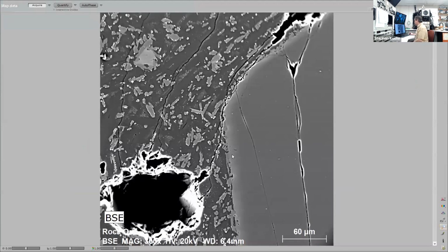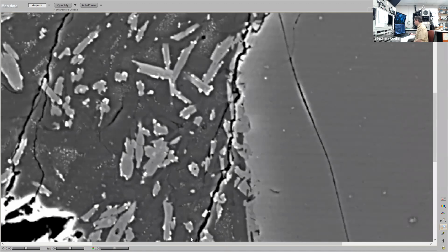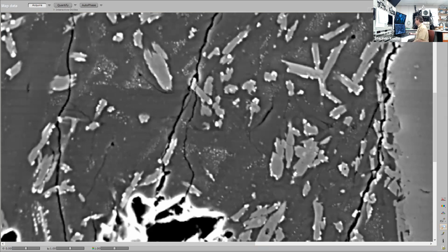And if I go and zoom in on this image, there's actually quite a bit of fine detail in there. We look in there, there's some crystals, and even at this magnification, they're itty bitty little specks. Those might be 100 times smaller than the width of the hair on your head. Again, really small.